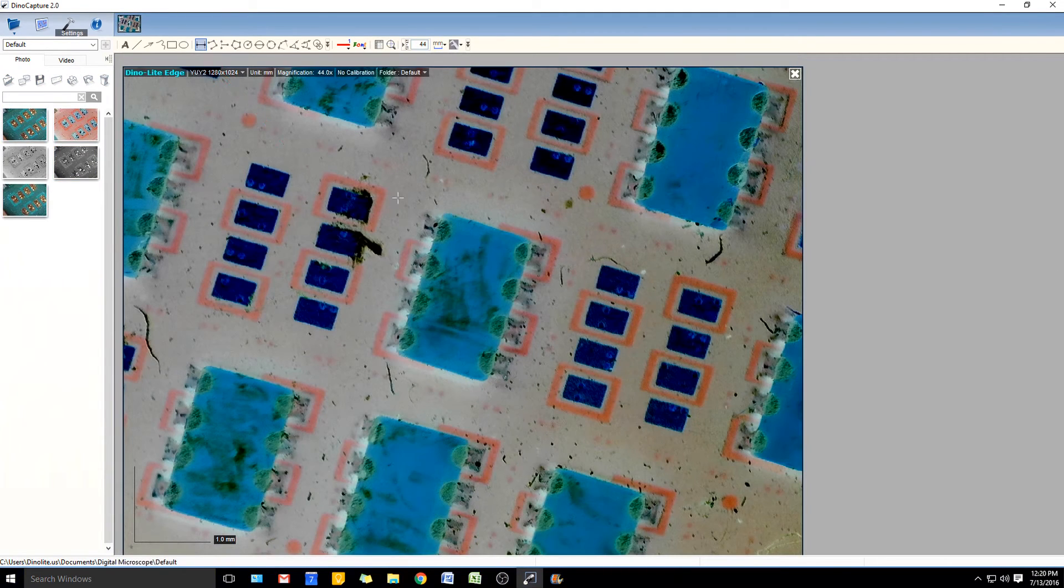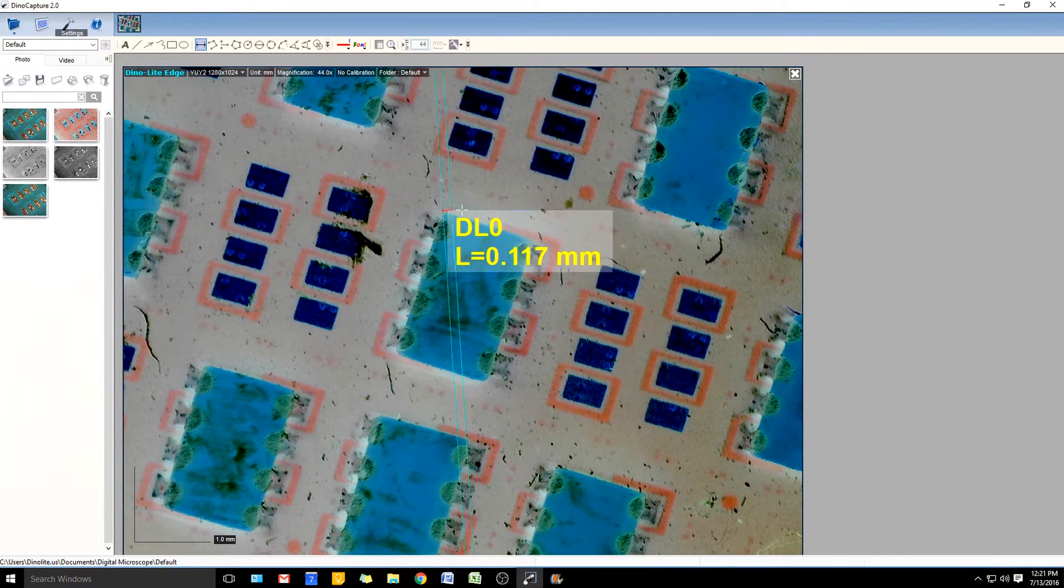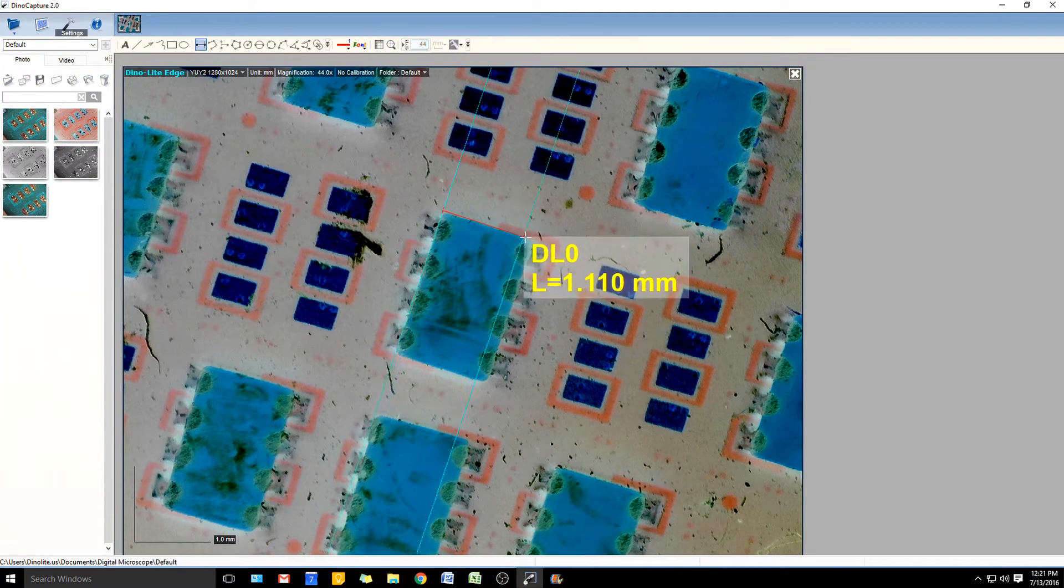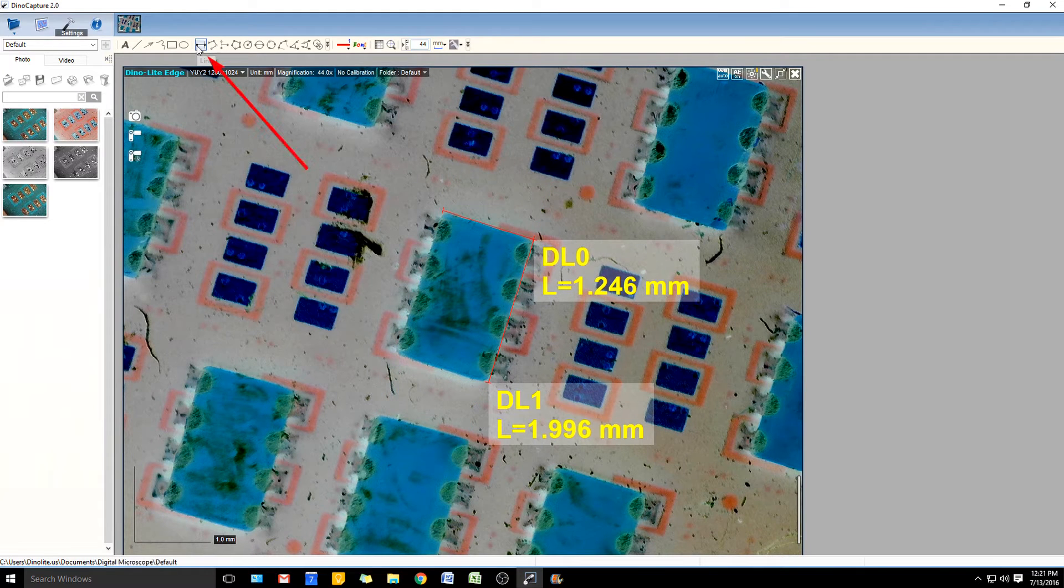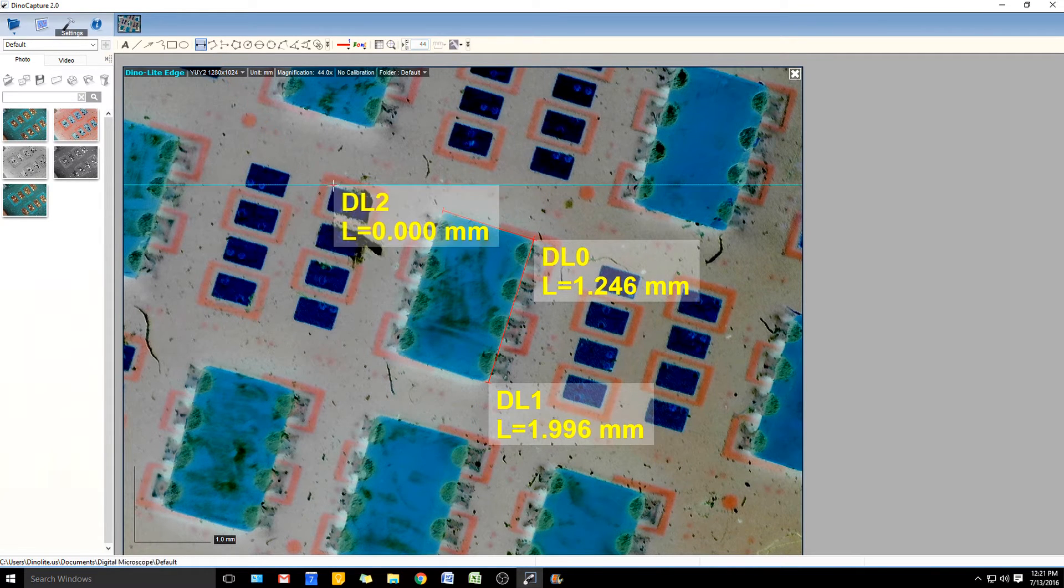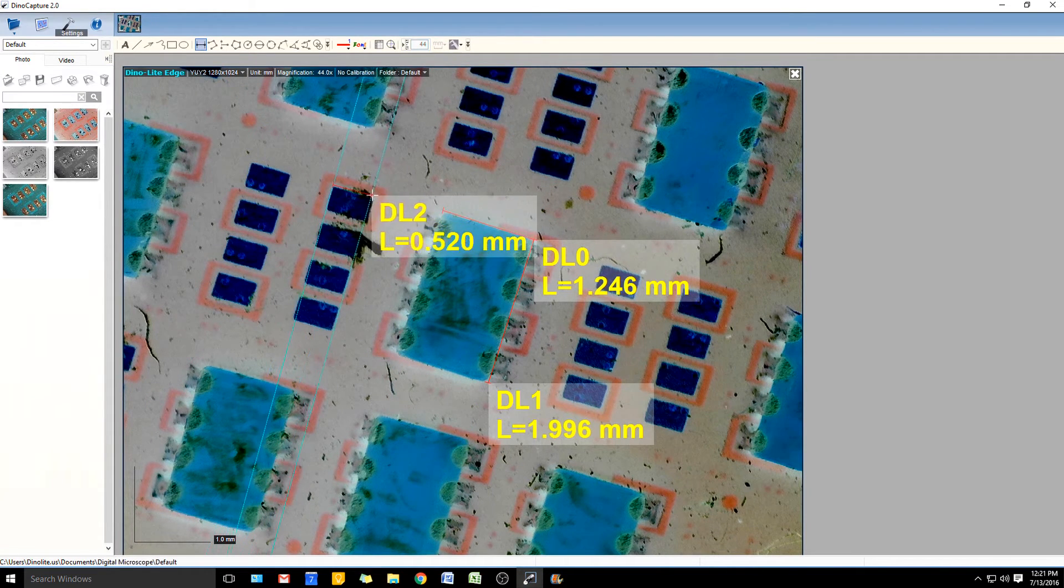Assigning a shortcut key to measure makes performing numerous measurements a lot faster, addressing the needs and requests of heavy-duty DinoCapture users.